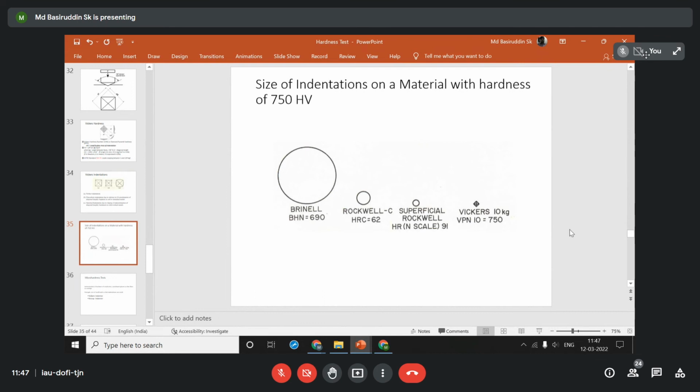Means you put, say, 1,000 indentations on the surface, maintaining a particular distance amongst the indentations. Then you check whether the coating has happened properly everywhere or not. So this is another perspective where nano indentations or micro indentations are generally carried out.